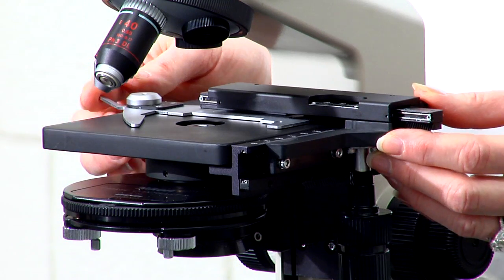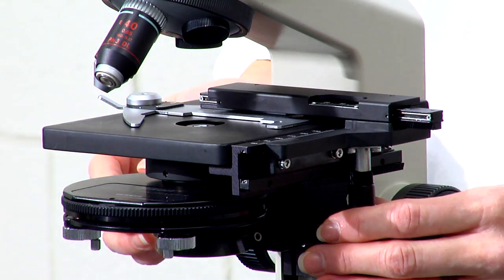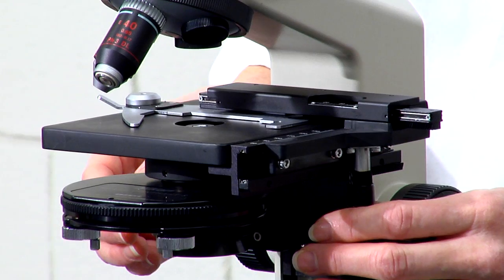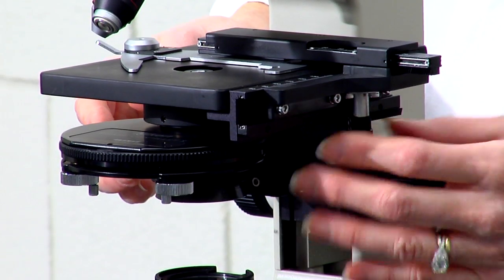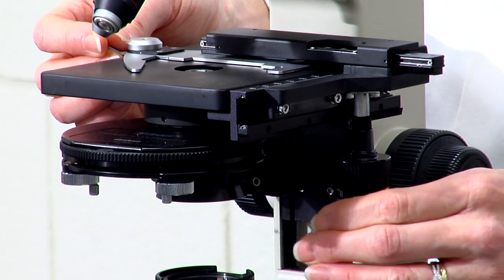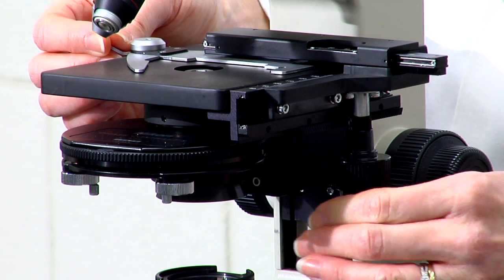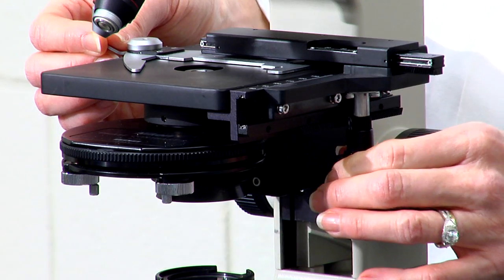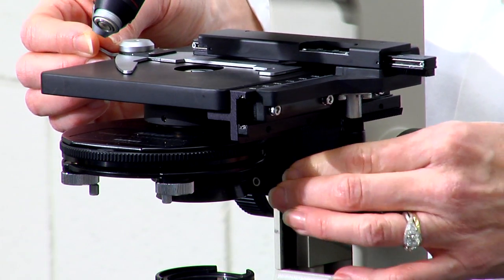Once the slide is secured in the clip, you can then move the slide back and forth using the mechanical stage dials, which hang down along the side. And they will move the microscope slide back and forth or forward and backwards.